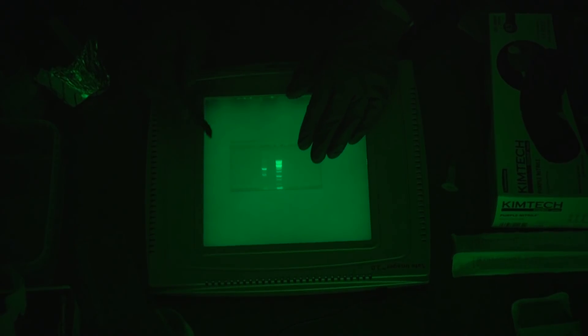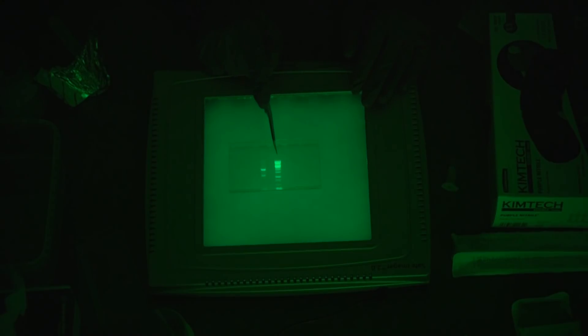Over here we've got the DNA ladder — a series of DNA fragments of known sizes that we can compare to our fragment in order to determine the size of our DNA fragment. And over here I see two brightly lit, well-defined fragments of DNA. The larger one is here, closer to me on this gel, and the smaller one is below, further away from me.